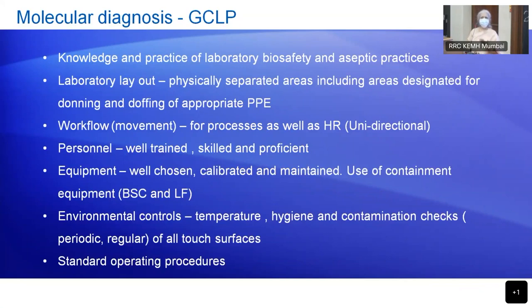All those things should be taken into consideration because in an infectious disease laboratory, you are dealing with hazardous pathogens. The hazard category could be risk level 1, 2, 3, 4, but there is a hazard with every single pathogen that you're dealing with. Therefore, you need to follow strict biosafety practices. And because you don't want contamination, your practices should be such that you don't introduce contaminants, and that is called aseptic practice.